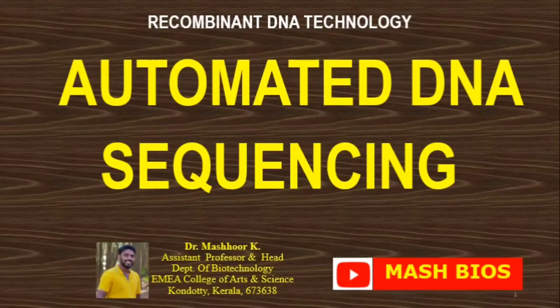Good morning. Today I would like to discuss automated DNA sequencing.